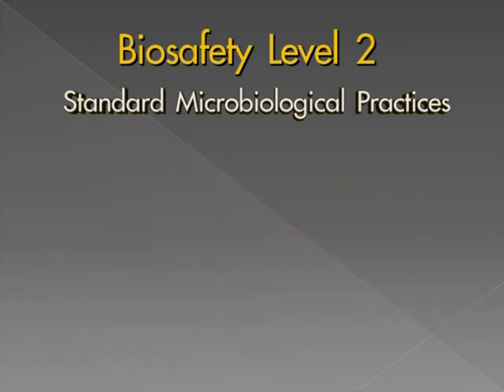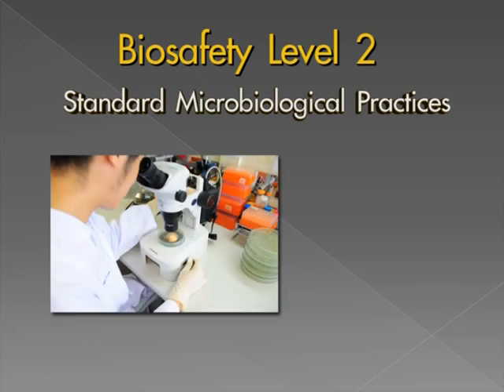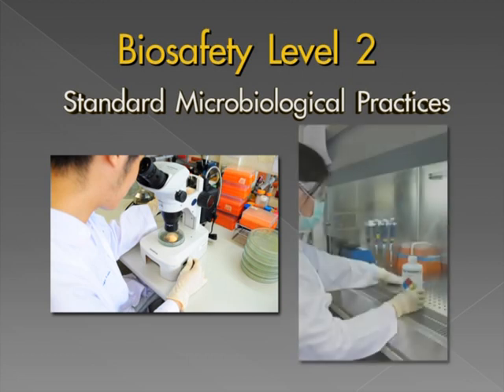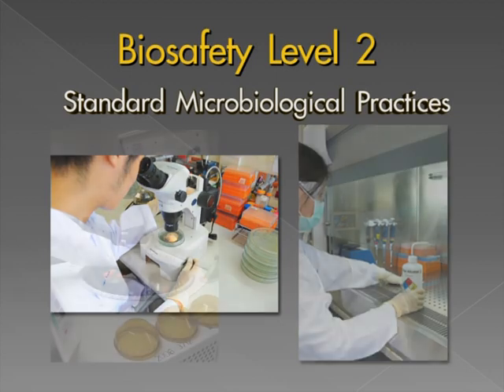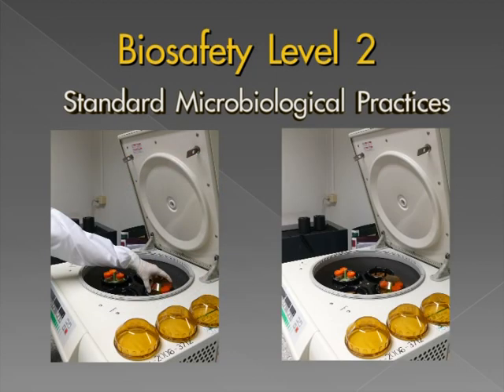In BSL-2 laboratories, some work may be done on the open bench by persons wearing the appropriate protective clothing or gear. Any work that may produce splatters or aerosols of infectious materials should be performed inside a biological safety cabinet, or BSC. Other containment devices, such as aerosol containment centrifuge cups, should be used where appropriate.